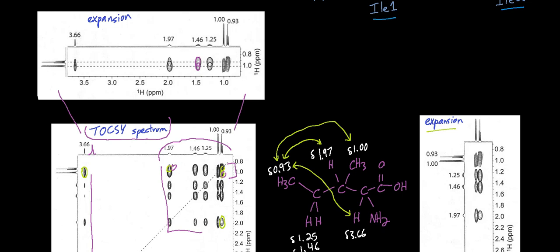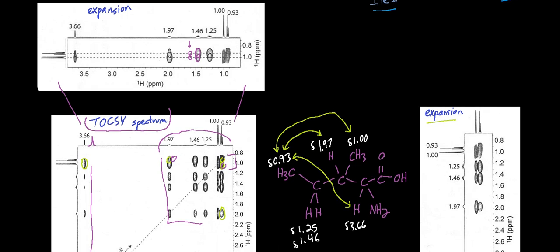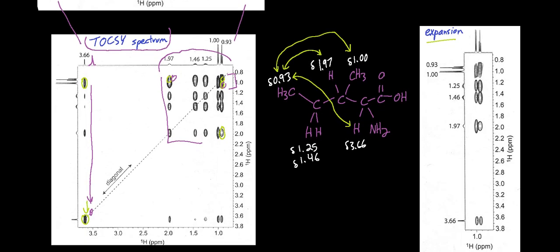So in the future, or with a higher resolution instrument, most likely all of these cross peaks, as they're called, would be finer resolved. I didn't mean to make that look like a cross peak, but they would be more resolved like that. And so you wouldn't have these issues. Higher resolution at higher field strength solves a lot of problems. But even then, you're going to run across a molecule where you need techniques like this to resolve overlapping signals.